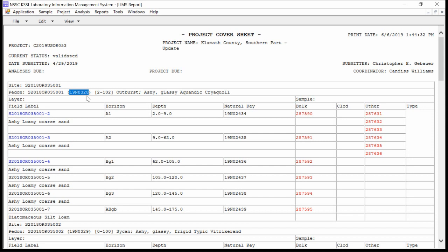Yes. Okay. Yeah, this is Rick. That in NRCS would be called the PED Lab SAMP-NUM column of the PED-on table. And the other natural key down below is under the sample table analysis, and it's known as the lab samp num column. Okay. Yes.